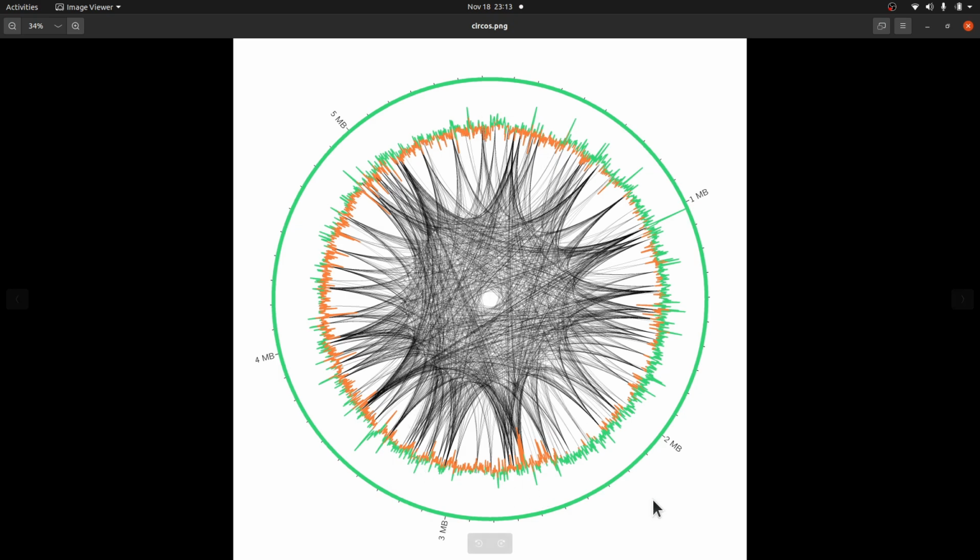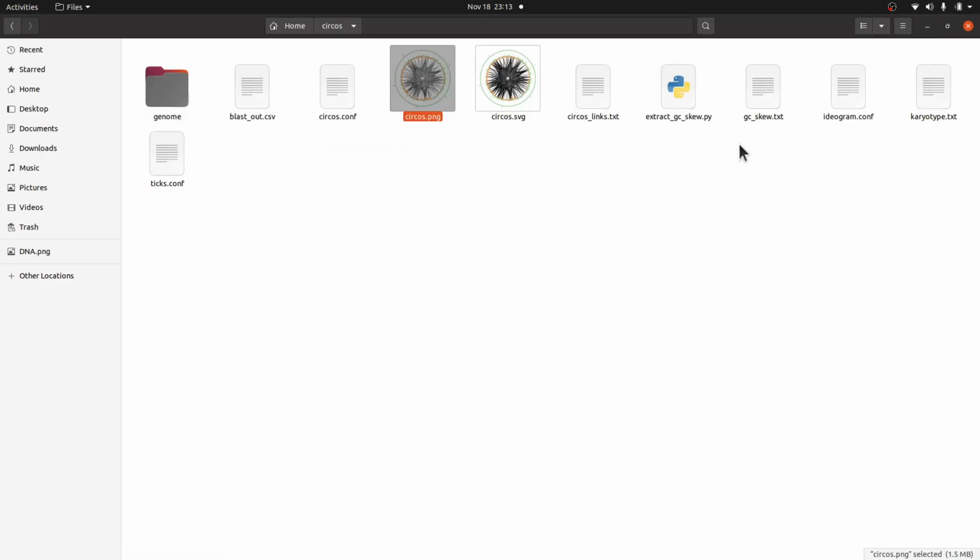With sequence data, there's lots of information that you can get, but the challenge that we face is how to present it in a way that will allow us to do comparison and also identify patterns. This is where Circos comes in. That is one of the things that we have done here. This is one of the things you can do with Circos. It's very, very good, so I will encourage you to check it out.